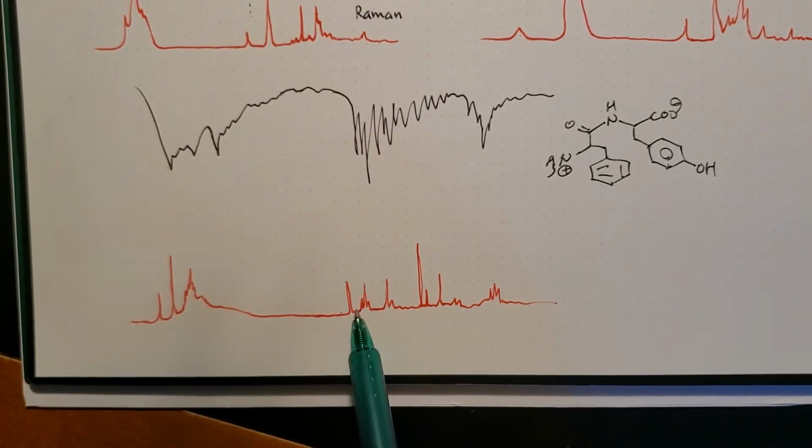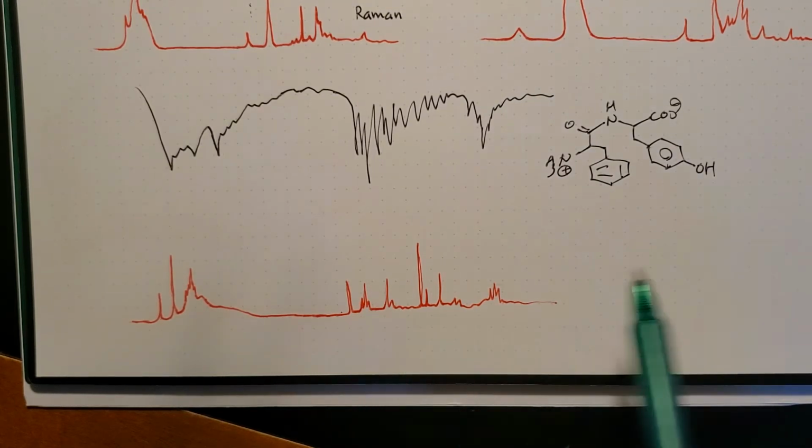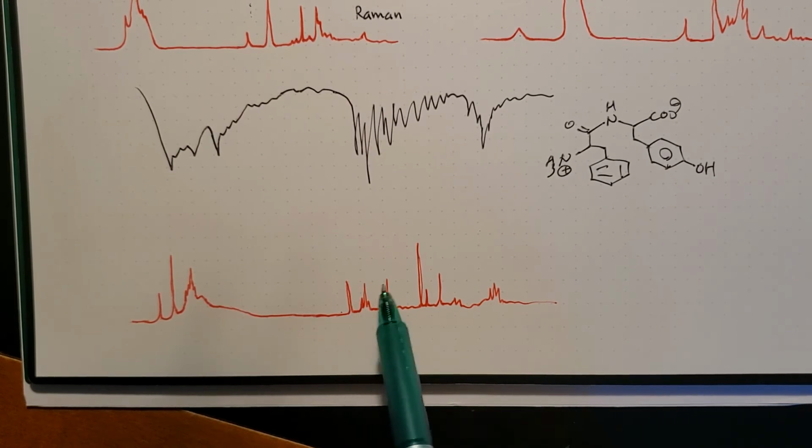Also, the carbonyl groups got weakened. Therefore, you start to see other signals, which is the carbon-carbon double bond, and you have a chance to differentiate which benzene ring belongs to where. So if something happens to one of them, then you can keep track of them with the Raman better. So you can see a very definite advantage of Raman spectroscopy over IR for certain cases.